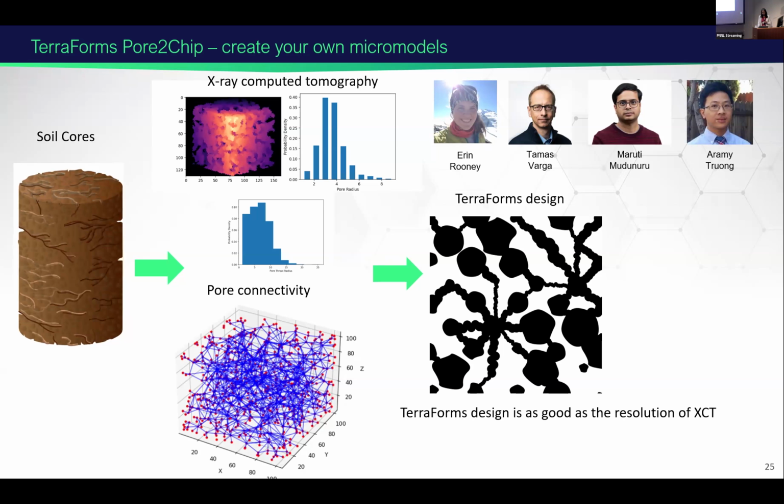So as an example, we have printed cores where we looked at disturbances such as freeze-thaw disturbance, where users have submitted soil cores from Alaska soil, where there is freeze-thaw disturbance, where the core has shown that there is a loss in pore connectivity versus an undisturbed core where there is no loss in the pore connectivity. And we can compare those as well using this particular technique.